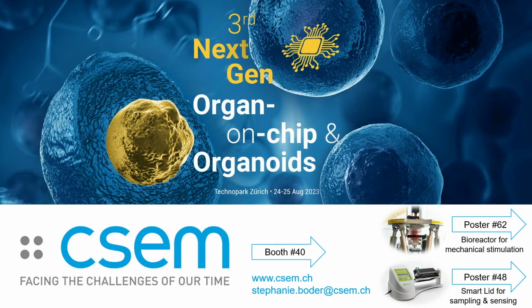Next question here. Hi, thanks for your talk. Lisa Mojanics from Elvesys Microfluidics Innovation Center. I'm interested if you can comment a little more on the recirculation mode of your lid, because it looks like you had 6 inlets and only 1 common outlet, and in particular whether the liquid mixes during the recirculation between the different wells.